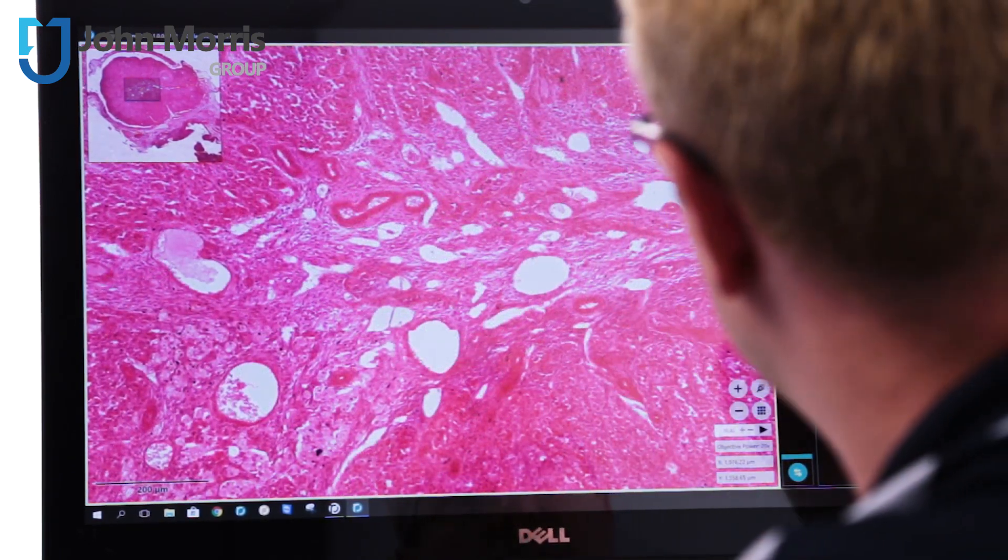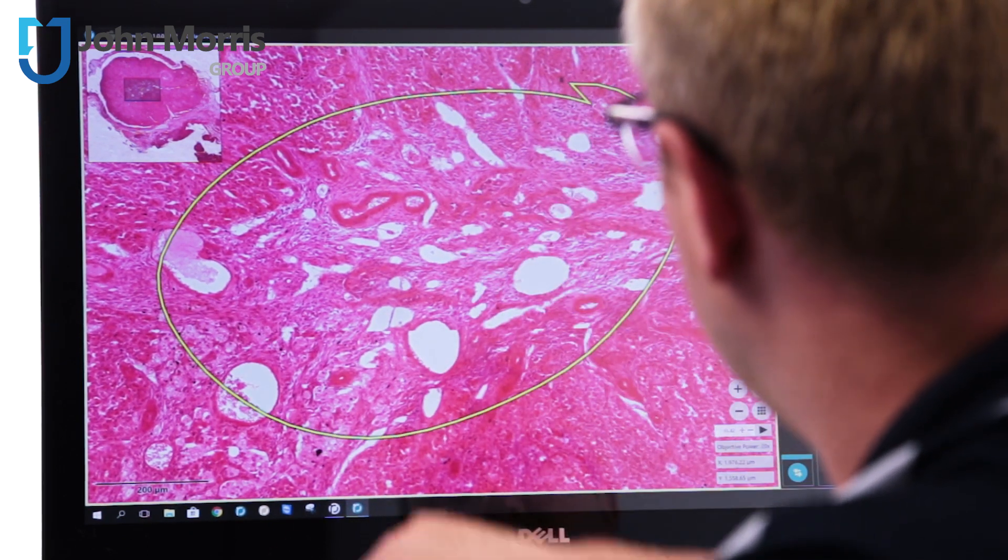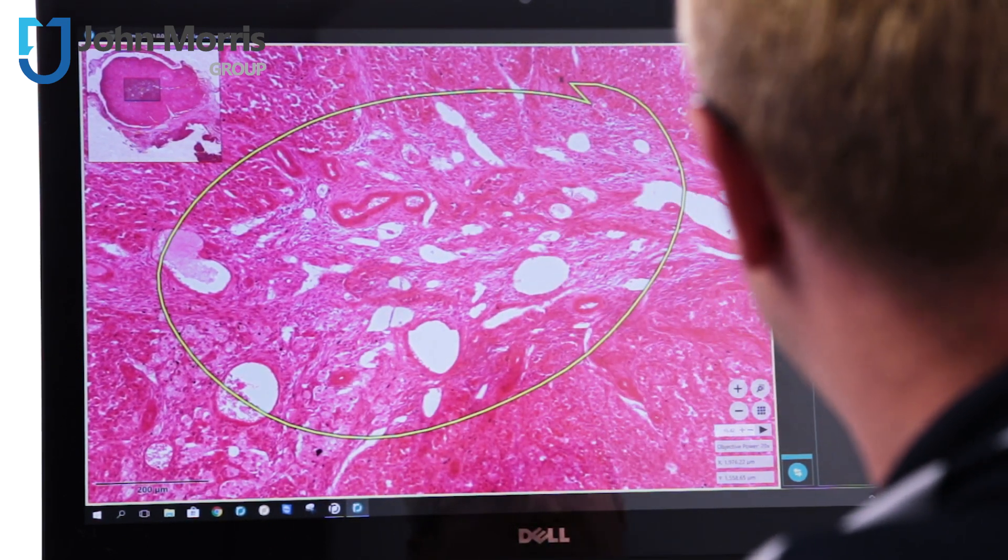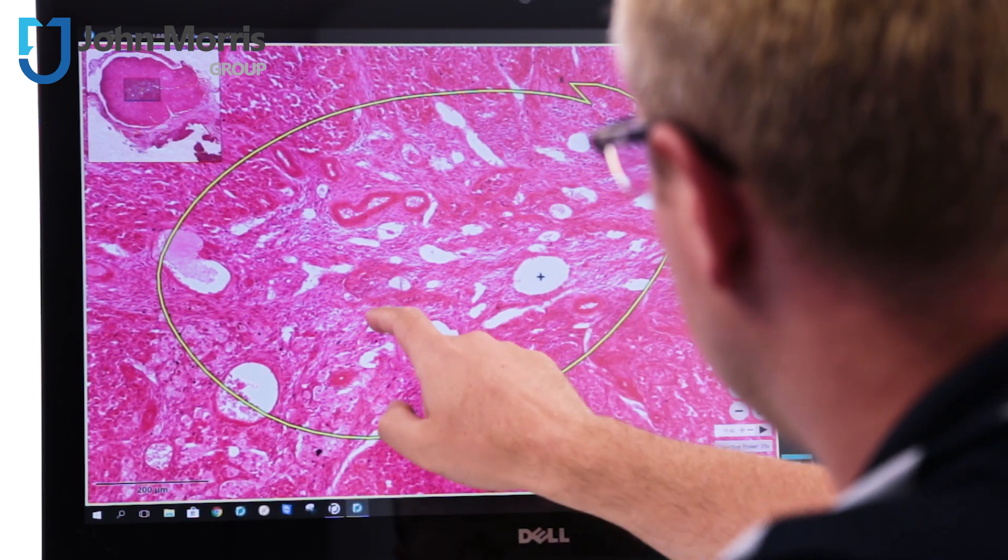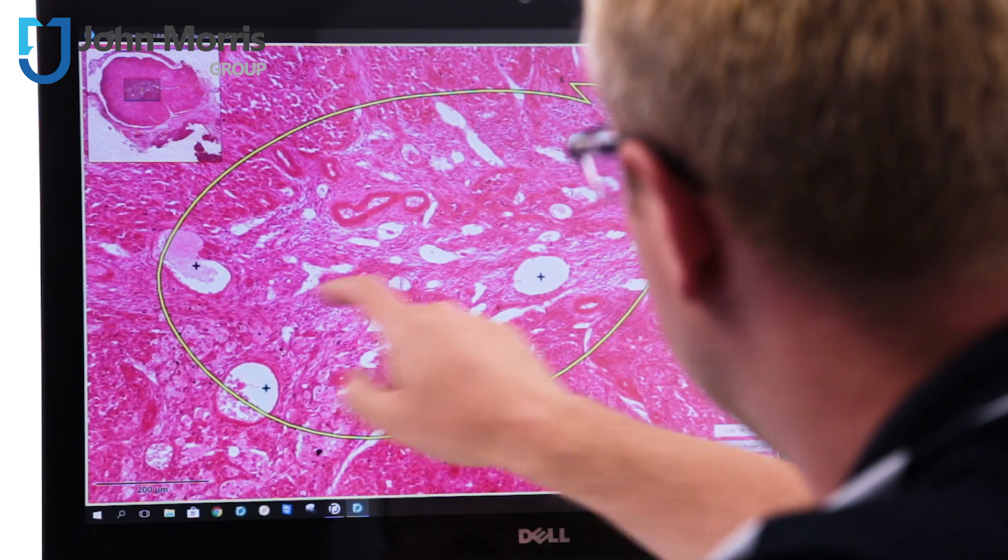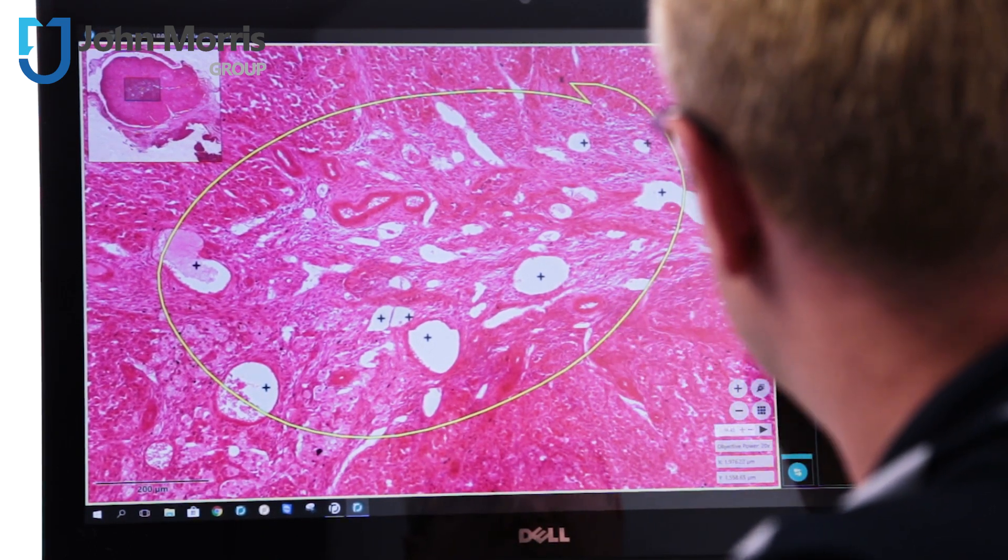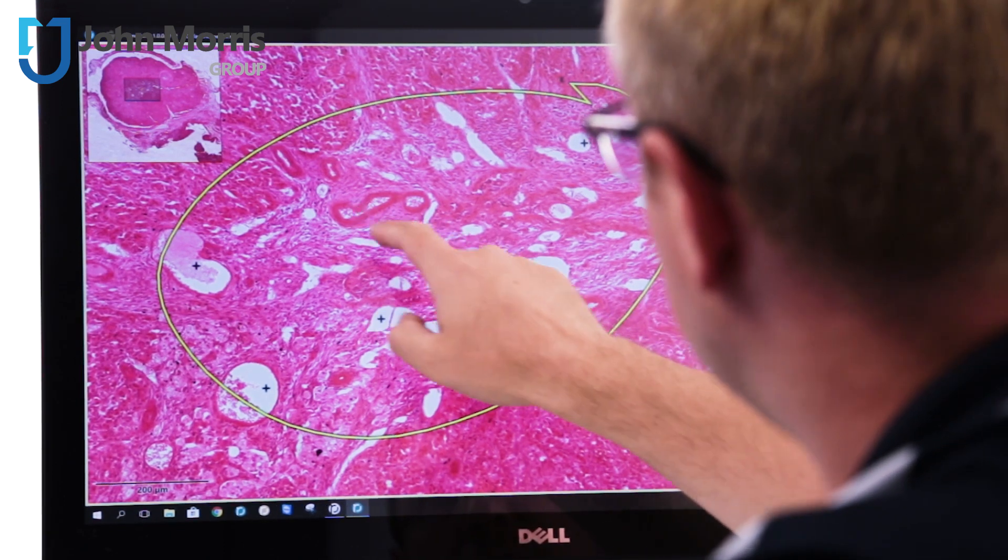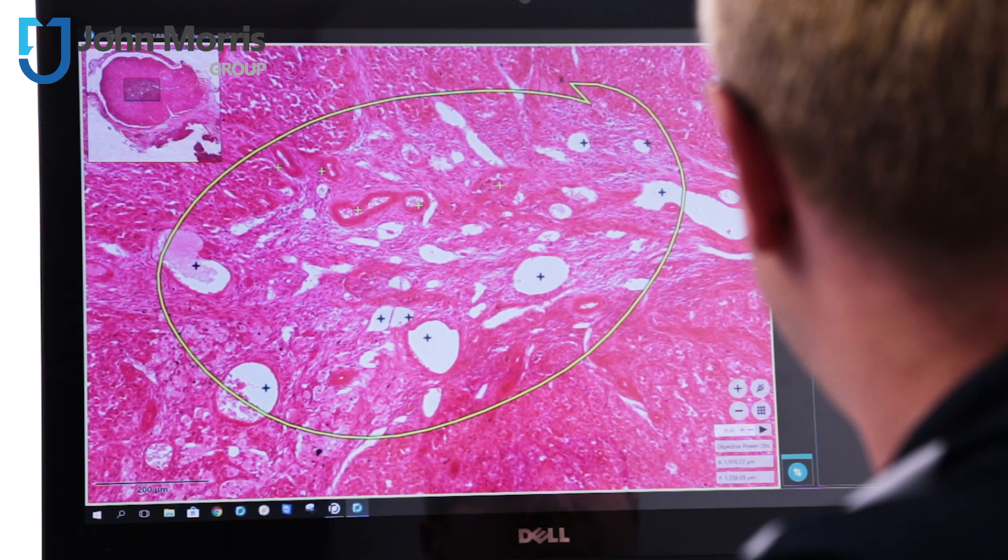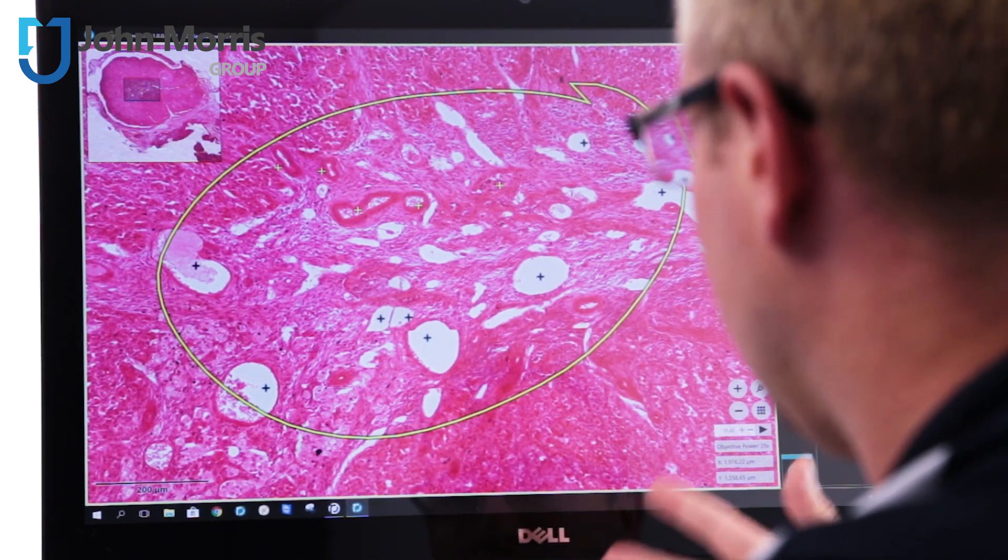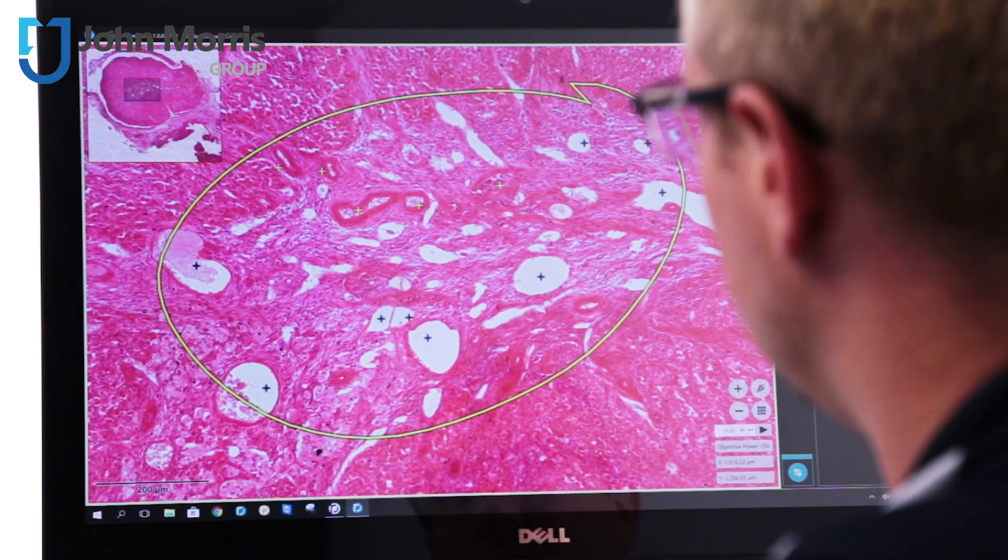Within the annotation mode we've also got a handy counting feature so if we define the area here you can see we can label different species and in species number one we might identify some, it'll count them, species two you might say these ones here and you can see it's actually tallying them up along the right side and we can export all of this for later observation by somebody else.